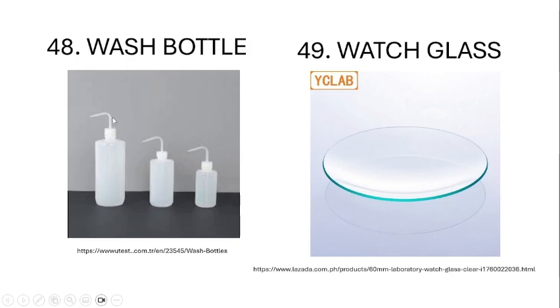Next is your wash bottle. So this is made of squeezable plastic. It is used to contain water maintained at a specific temperature. So wash bottles are usually filled with distilled water.